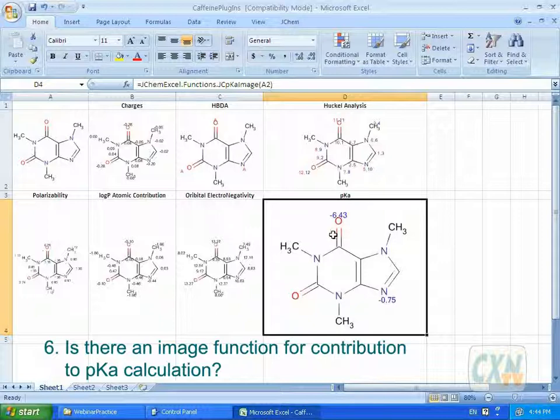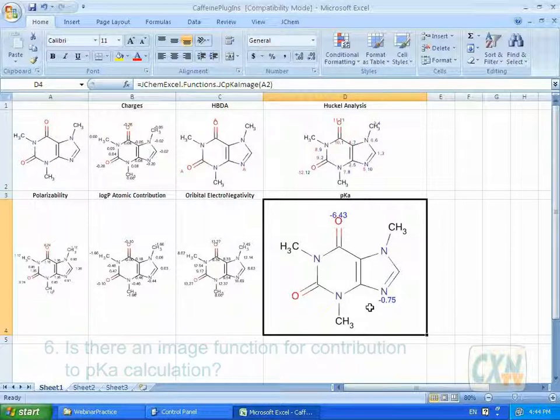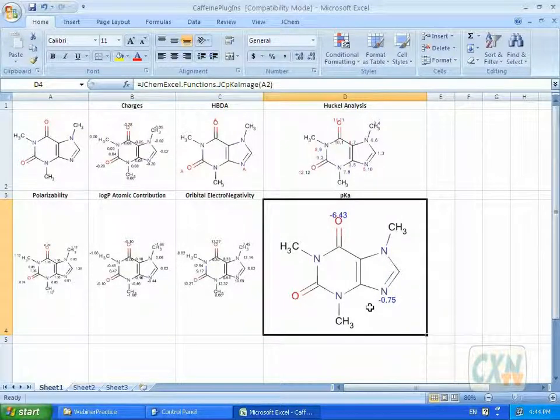Basically, we use the ChemAxon API and get the modified structure from there. So if there is anything missing from that, please let us know, but we will also double check. But at the moment, we do not display charts or graphs as they are displayed in Marvin. Yeah, we can add that in the future.